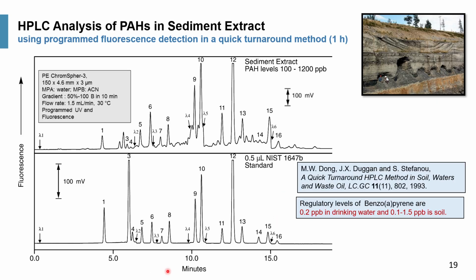This is another demonstration of a quick turnaround method for sediment, which is very complex. One can actually do a quick turnaround in 1 hour, right? From the sample, some very simple extraction technology, and inject directly. You can see that in comparison with my NIST 1647 method, right? Even for a sediment extract using very simple cleanup, some of these are very prominent, right?